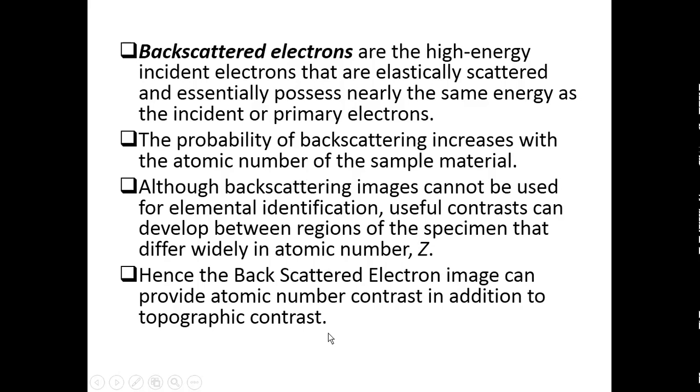So, there is a backscattered electron detector. Knowing the backscattered electron detector and their energy, this backscattered electron signal can give an understanding of the atomic number of the material which is deposited as a film or nanoparticles over the surface.